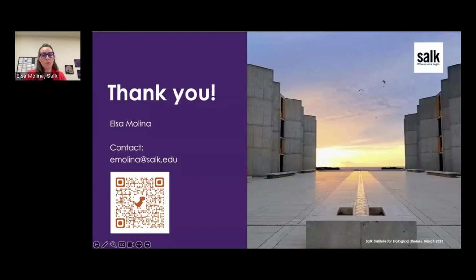But so far, I would say stick exactly to the protocol, because I've seen some people not following exactly the protocol and not having any data at all, just because they didn't use the correct buffer, for example. So this is very important, and you should always make sure the tissue prep, even cutting your tissue, is done by someone who has experience and knows how to do it.